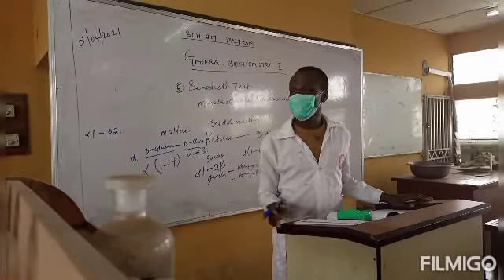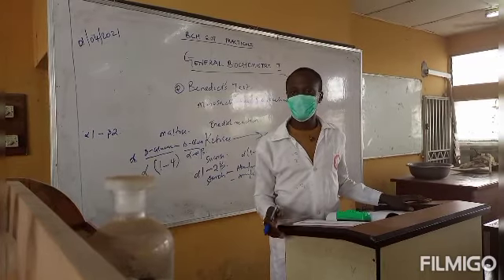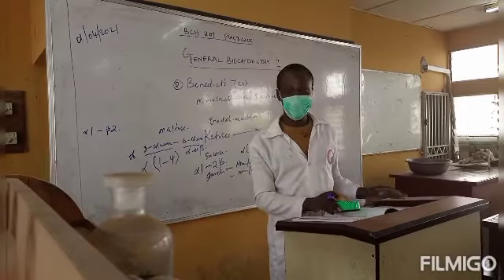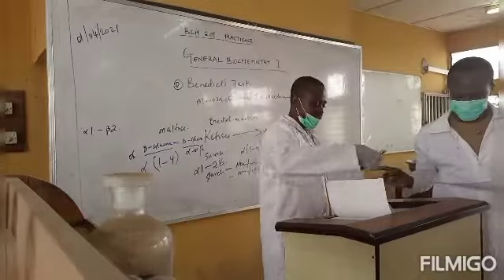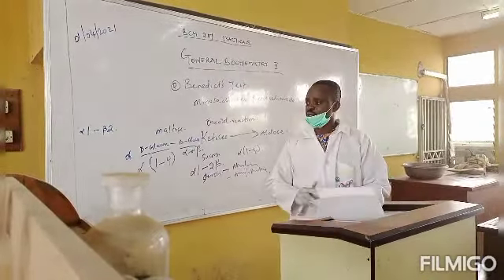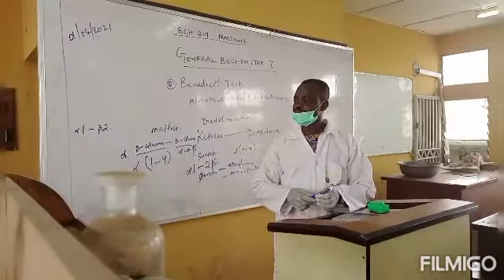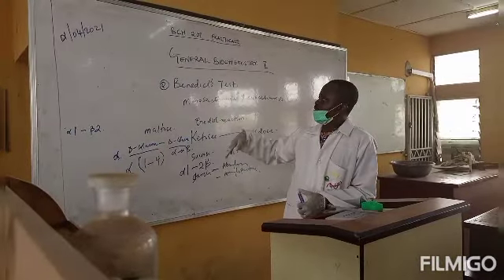So I'm going to invite the chief laboratory technologist in the department to come and demonstrate all the practicals for us. Thank you very much. Okay, Mr. Moses, for that brief introduction of the theory. Now we shall be going to the practical, and we'll be taking out the tests you highlighted one by one.